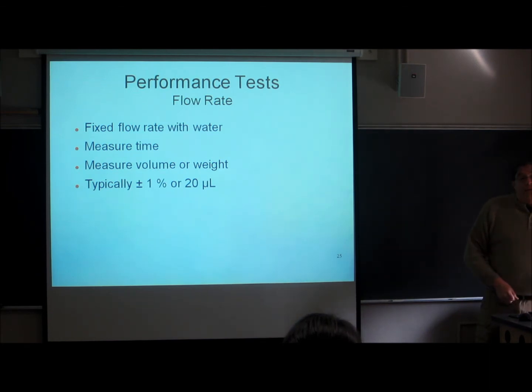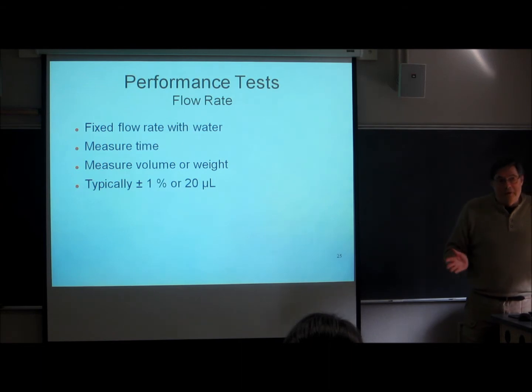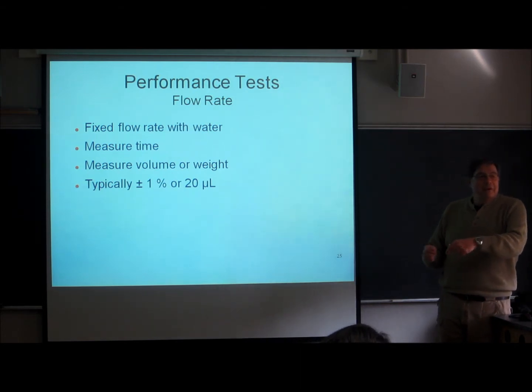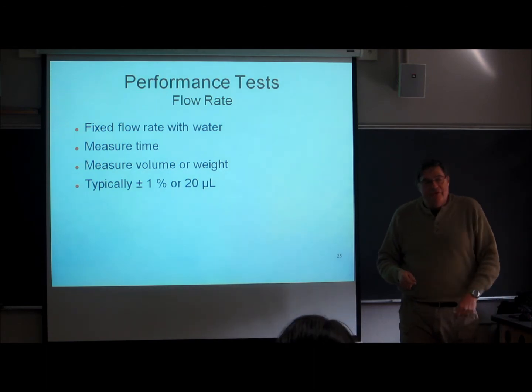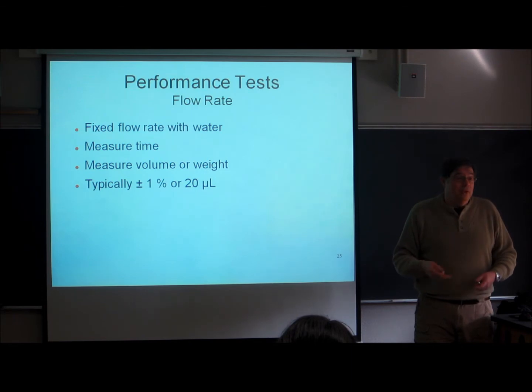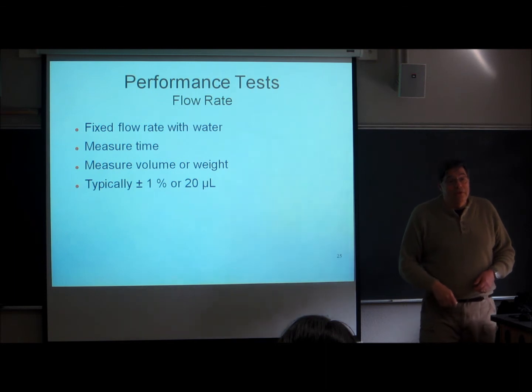So flow rate, how do you measure that? Old-fashioned way, a stopwatch, an analytical balance, and a vessel that will not allow much evaporation because it takes a while. What you do is you turn the instrument on to a particular flow rate, take the output from the detector, put it inside your vessel. Oh yeah, weigh it before you put it in there. And then turn on the stopwatch and count for 30 seconds, 50 seconds, whatever it takes. And then weigh the amount of liquid that's transferred.